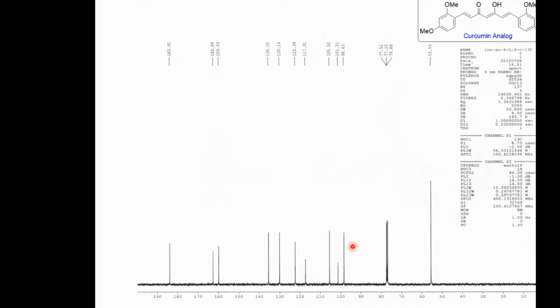It should not be, right? Sorry? The other two are the carbons which are attached to the, yeah. Oh, these two? Yeah. Those two are here. That's quite intense. Those two carbons are here. These are quaternary carbons. Of course, I'm telling from our experience, but we can confirm it by APT or DEPT. These are quaternary carbons. Their intensity is high. And because the OMe will come here, the aromatic carbon to which methoxy is attached will come here. Okay, thank you. Intensity is slightly high.